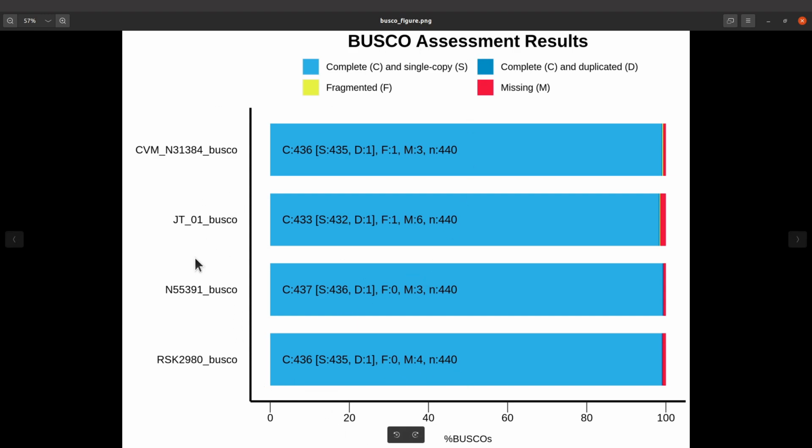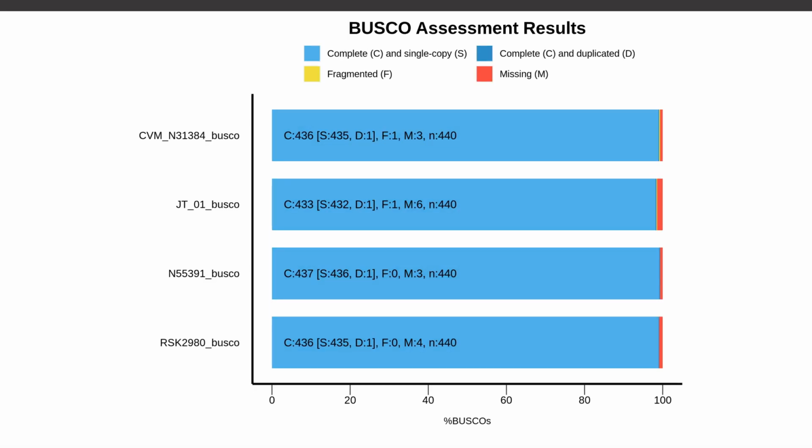Now you can also add more samples. Here we had 4 samples, and I showed you how to automate the process. But the approach I used may not be appropriate if you have, let's say, 50 samples or 60 samples or hundreds of samples. In that situation, there is a better alternative. If you have lots of data sets that you want to run BUSCO on, and you're having challenges, you can always contact me and we can arrange a session together.